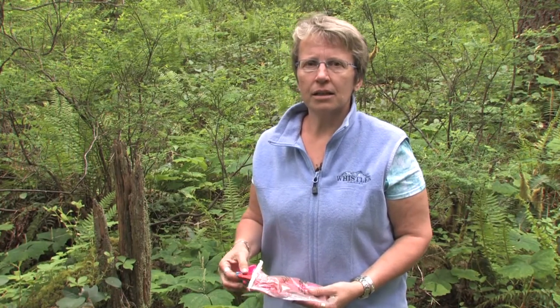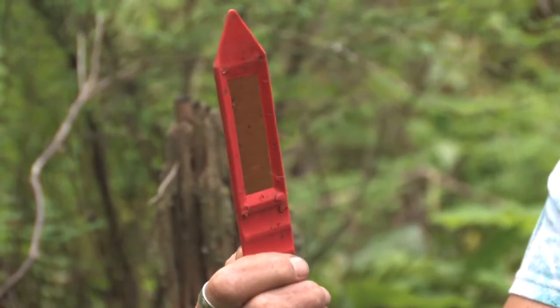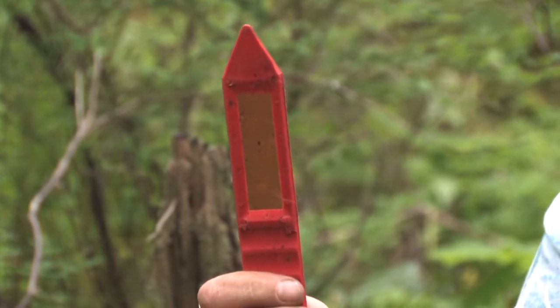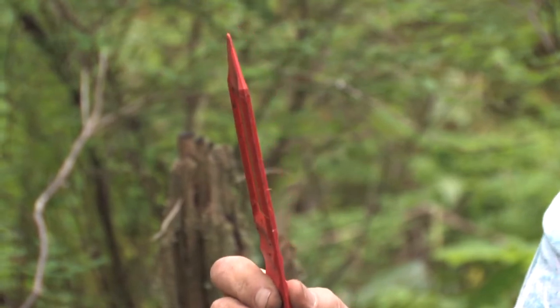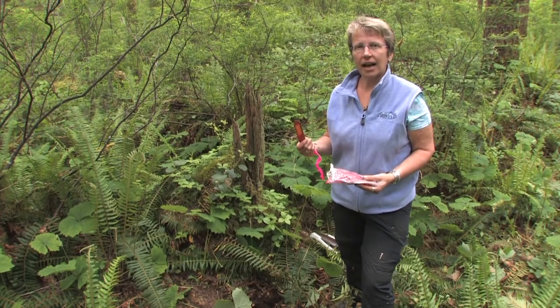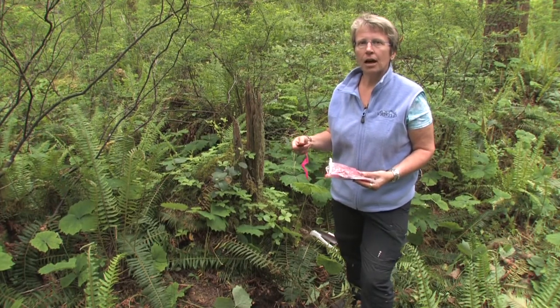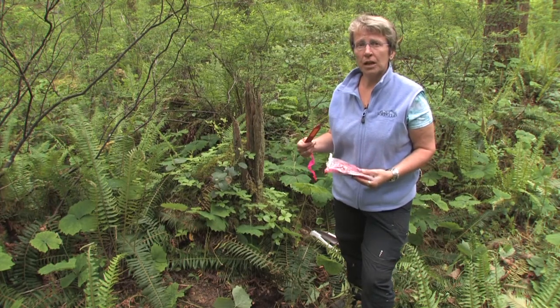We're here to measure nutrient availability at the STEMS site and we do this using plant root simulator probes. These are ion exchange resins encased in a plastic coating, inserted directly into the forest floor layer and also the mineral soil layer. One type of probe adsorbs anions and the other cations, and we place these in the forest floor layer and the mineral soil, leaving them to adsorb over a two-month period.